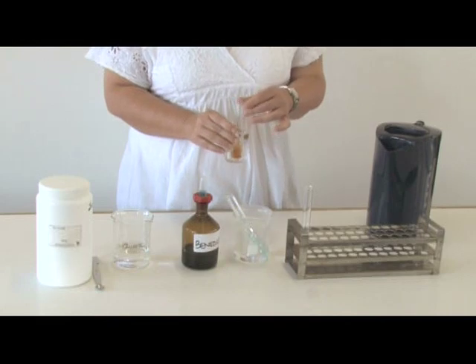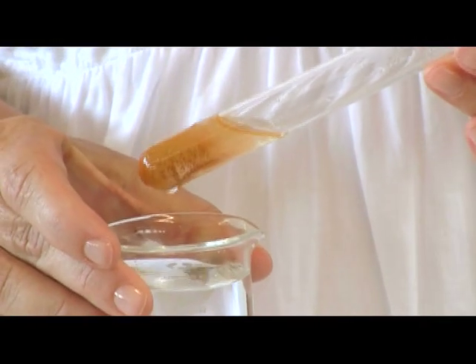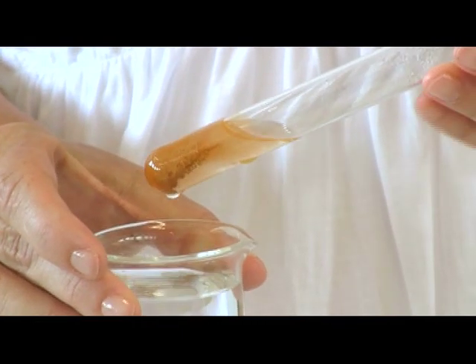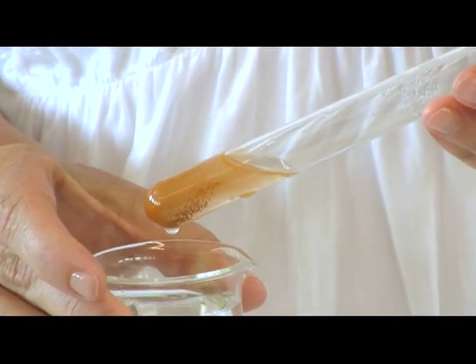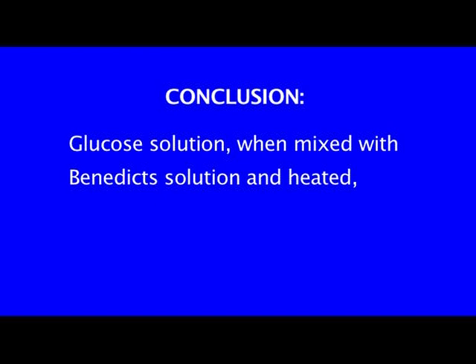Record any color changes you notice as well as the final color of the solution. The result is the solution turns orange-red. The conclusion is that glucose solution, when mixed with Benedict's solution and heated, turns an orange-red color.